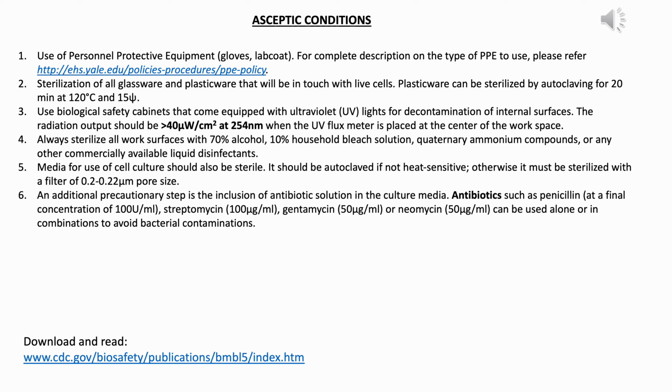But how effective this decontamination is, there is a lot of debate actually, whether it is really effective or not. Because many times people don't know whether the UV light that is coming is actually of good strength or not. Because the glass tube that is transmitting the UV rays gradually loses the ability to transmit short UV rays over time.